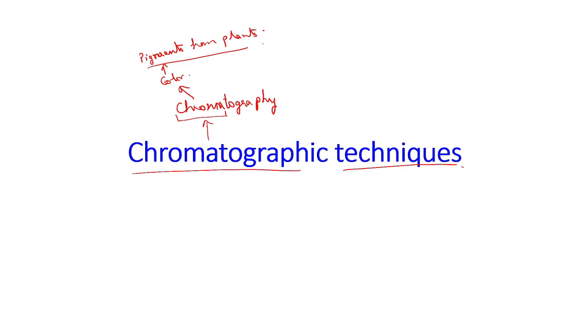On the other hand, the word graphy, the meaning of the word graphy is to write. So what does this mean? This means that we are analyzing the color pigments on a specific piece of instrument or a device. So depending upon the information the colors will be generating, based on that we usually go for the separation or the analysis.